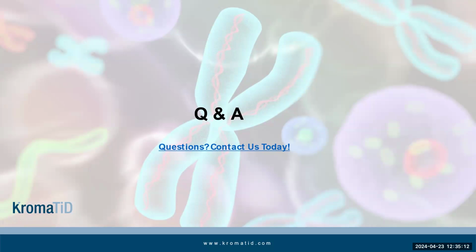And one final point there is because the DGH probes are targeting one chromatid, at all of those insertion sites, you're not only going to be able to determine that the insert is present there, but the signal pattern of the probe signal at that site is going to indicate whether structural rearrangements have taken place there as well. For instance, if there's been an inversion, what orientation the probe has inserted in, etc.